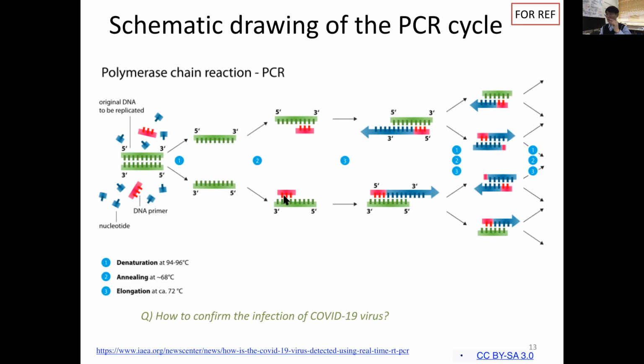by hybridization. And this is the starting point for replication so that we can elongate at 72 degrees with these DNA nucleotides and polymerase. So the polymerase chain reaction happens, and on the opposite side also. So one DNA strand becomes two, and we repeat this. So it's 1, 2, 4, 8, 16. It keeps multiplying until millions of copies can be made. This is a very nice, cool idea, which led to a Nobel Prize in 1993.